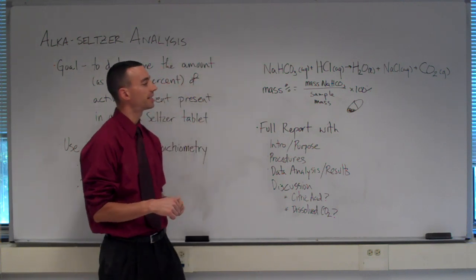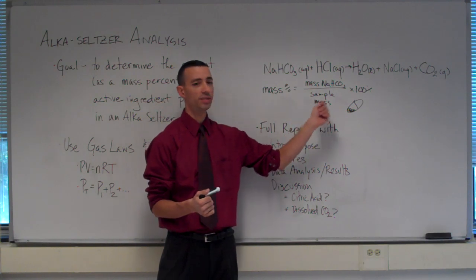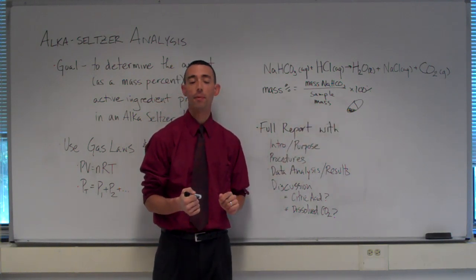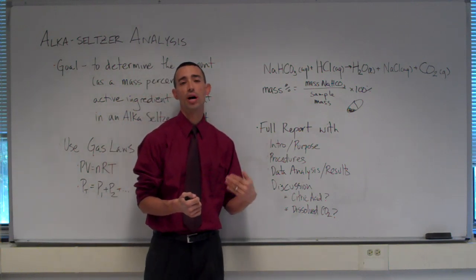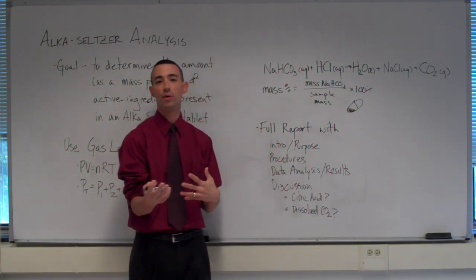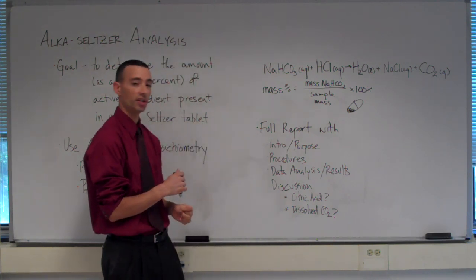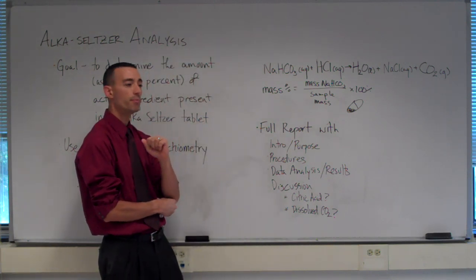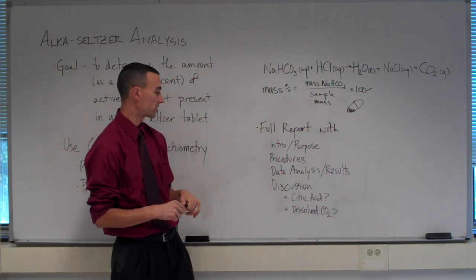You don't need to say that sample 1 weighed out as 0.227 grams, for example. You would indicate we weighed out 3 samples of approximately 0.2 to 0.25 grams. It's a much better way to approach the procedure. Okay? And give the important highlights of your experimental process.